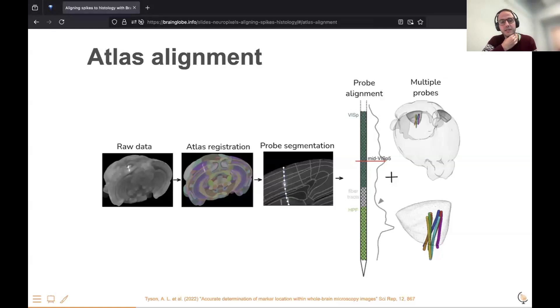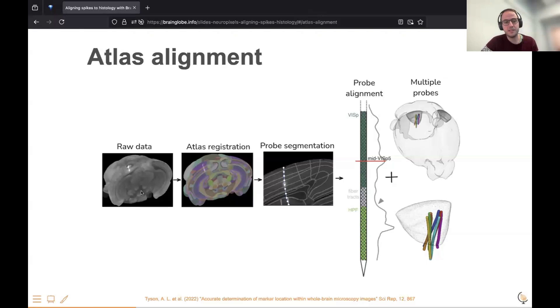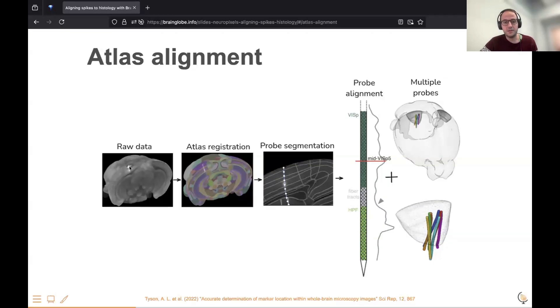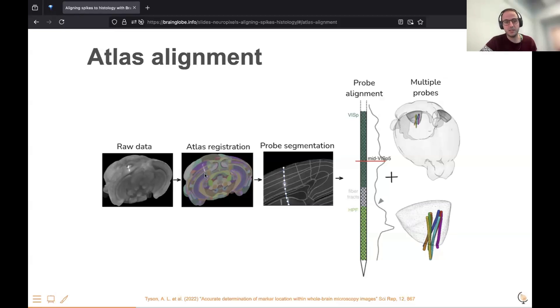The tools that you would use here all work in kind of the same way. You take your raw data — the same data I showed before, just cut in half and visualized slightly differently. You can see a part of the probe here. You register it to an atlas, which means you align it to a standard coordinate space by matching your sample image to a template image, a reference image that is an average mouse brain. There are many atlases, and that shows you the location of the probe overlaid with a segmentation of this atlas.